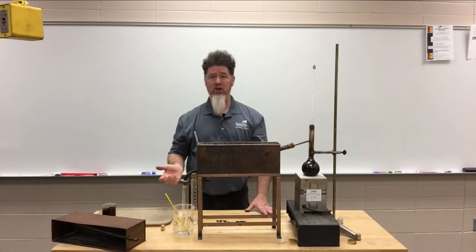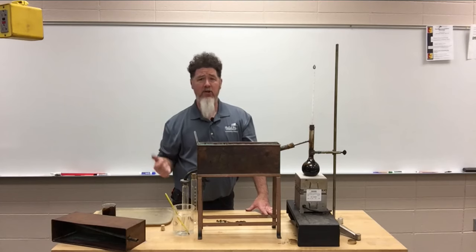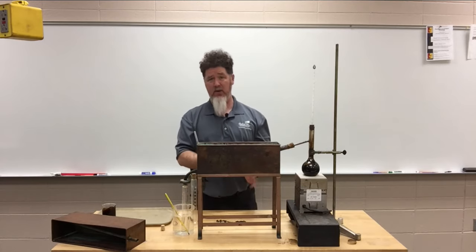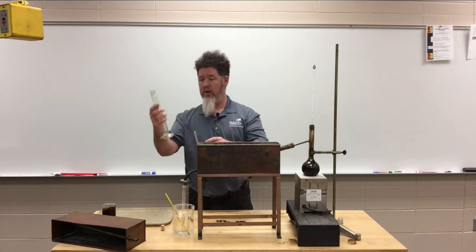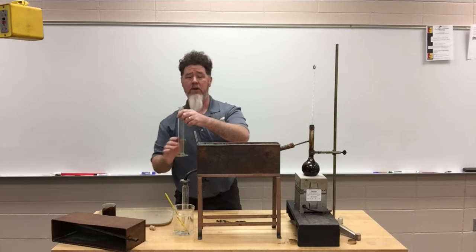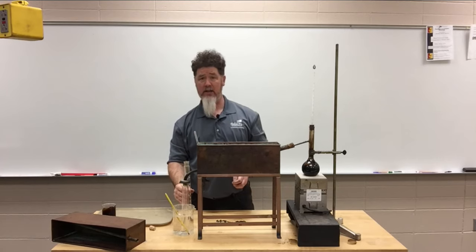Now at some point, I'm gonna switch over from making gasoline to diesel fuel. Maybe I do that at 350 degrees, maybe I do that at 375, maybe I do it at 400. I let the students typically decide when they wanna stop making gasoline and when they start making diesel fuel. But at some point, I will swap this out. So I'll pop this out, I'll put a cork in it to make sure I'm not losing any of my vapors, and I'll put my new beaker underneath it, and I'll start collecting diesel fuel.